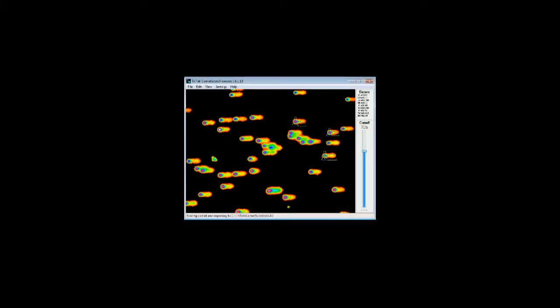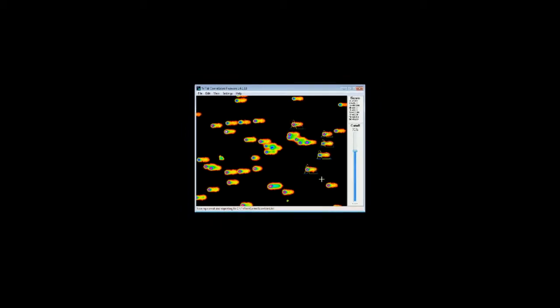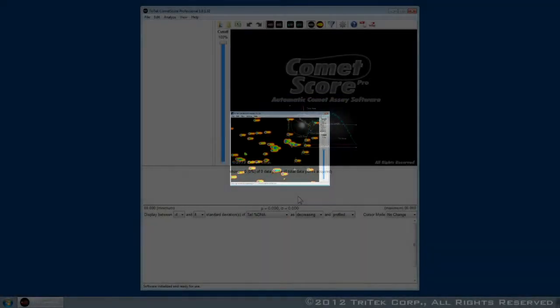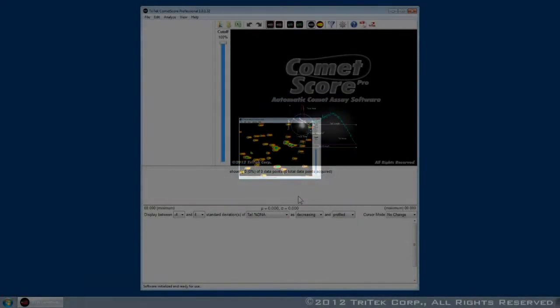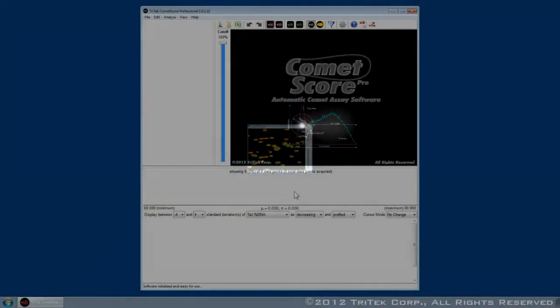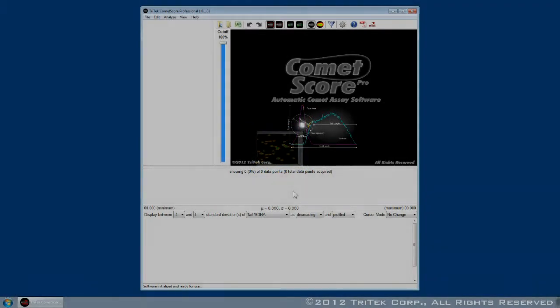For nearly a decade, researchers around the world have relied on Tritec's CometScore software to evaluate DNA damage in their Comet assay samples. Now, Tritec takes Comet assay scoring software to the next level. Welcome to CometScore Pro.